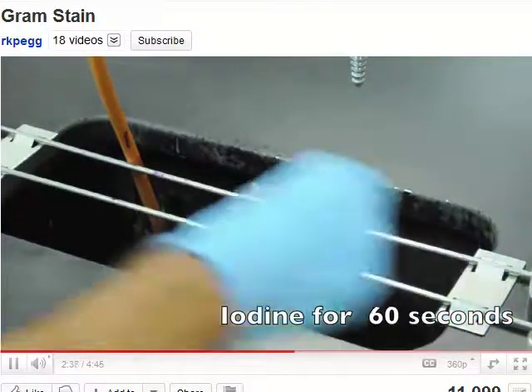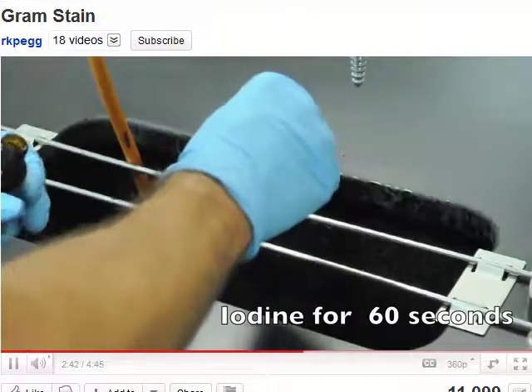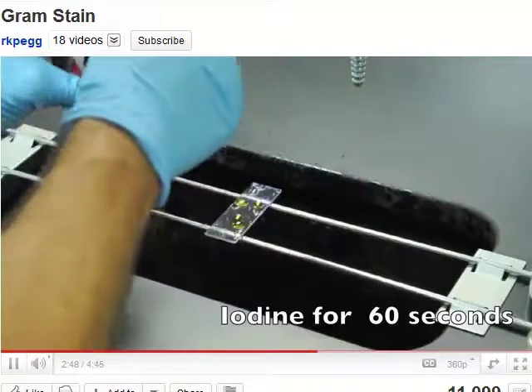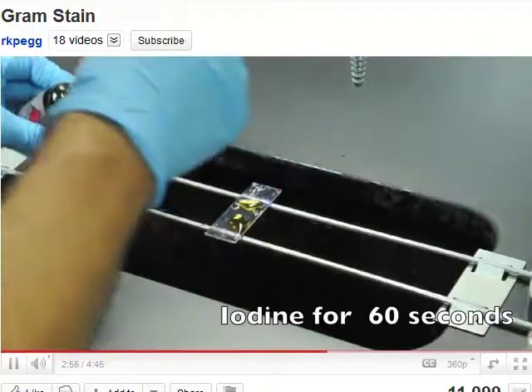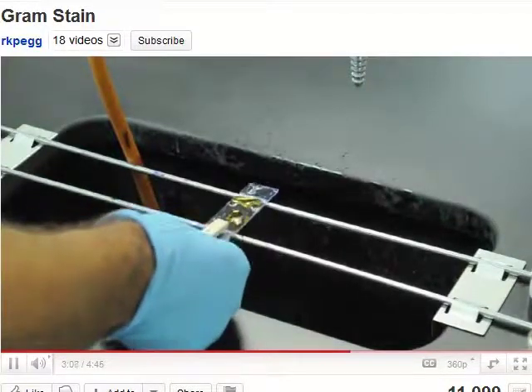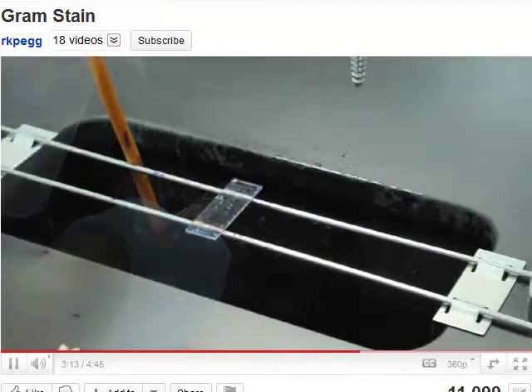Now we've returned it, and we're going to add the Gram's iodine, which we're going to leave on for 60 seconds. Now this is going to form the CVI crystals, the crystal violet iodine crystals. Iodine is a mordant. It's going to complex with the crystal violet. Crystal violet is soluble, but the crystal violet iodine crystals are not. So you can see the two areas, which we could actually see visually as blue. We're not going to let the whole 60 seconds elapse here in this particular slide.